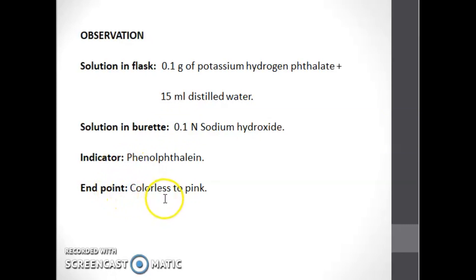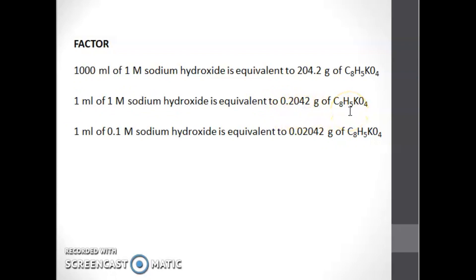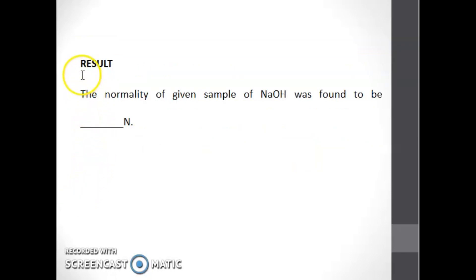Add 0.1 ml of phenolphthalein solution and titrate with sodium hydroxide solution until a permanent pink color is produced. The reaction involved is potassium hydrogen phthalate reacting with sodium hydroxide in a neutralization reaction to give sodium potassium salt of phthalic acid and water. The observations: solution in flask is 0.1 gram potassium hydrogen phthalate in 15 ml distilled water; solution in burette is 0.1 normal NaOH; indicator is phenolphthalein; endpoint is colorless to pink. The calculation factor: 1 ml of 0.1 molar NaOH is equivalent to 0.02042 gram of potassium hydrogen phthalate.